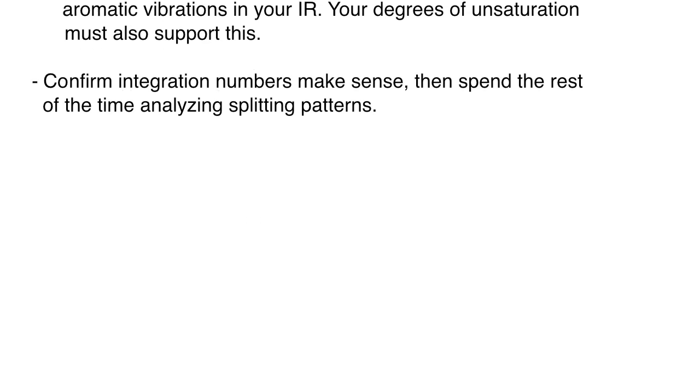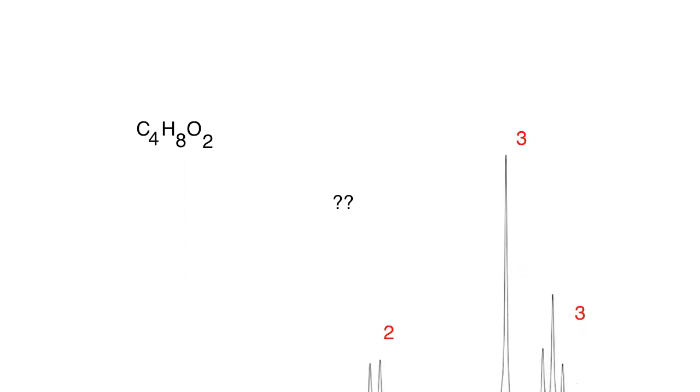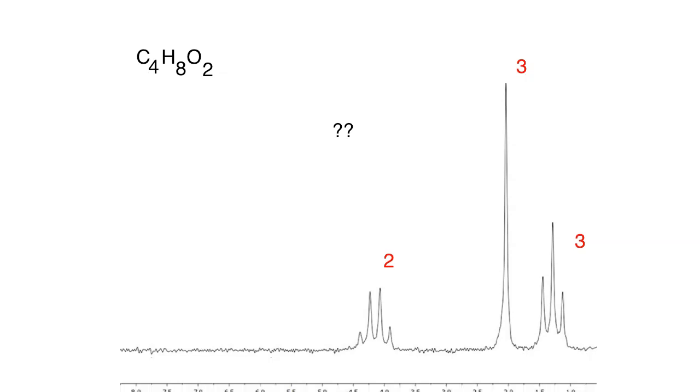So let's take a look at some examples before wrapping this up, and then we will go on to the practice session next. And that is where we will tie all of this together. We'll do an example that has everything starting with degrees of unsaturation all the way down to the proton NMR. So I'm going to keep these structures relatively simple because we're doing it only in the context of the proton NMR. We don't have any supporting carbon or IR or anything like that here.